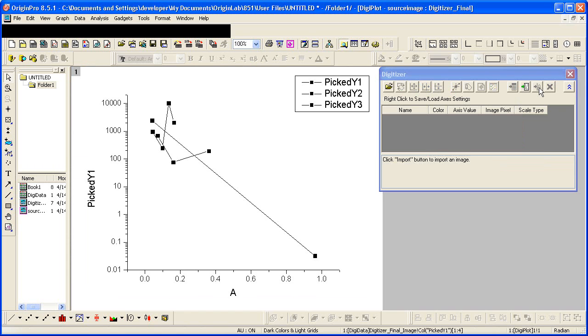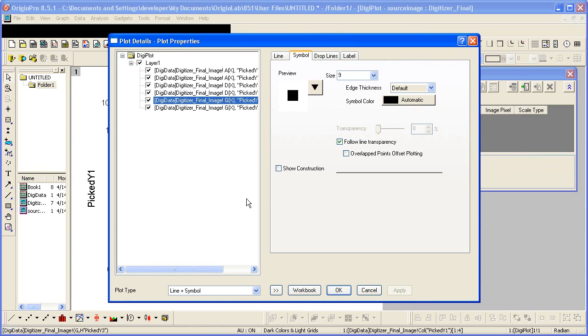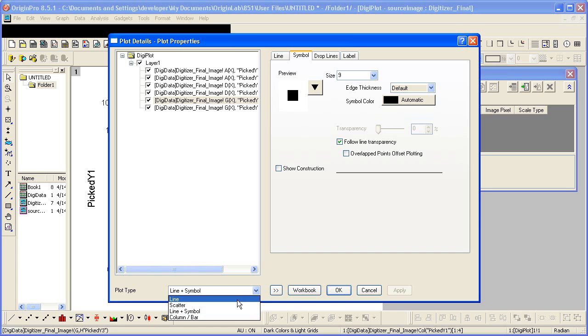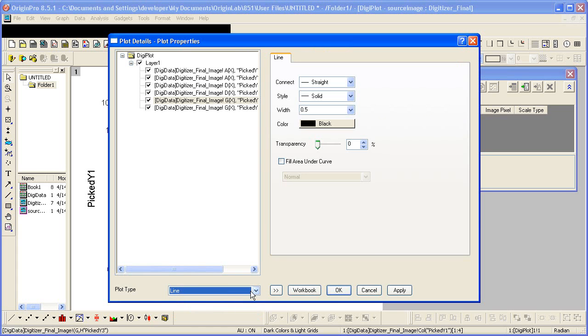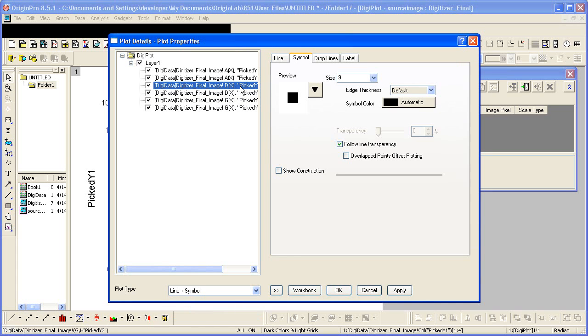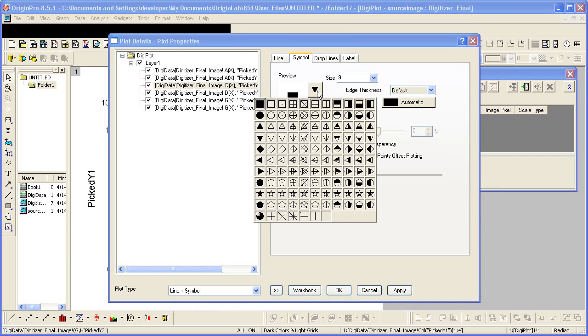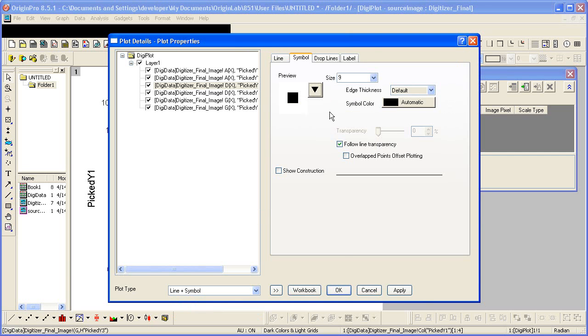If you wanted to change the plot type, you would double click. And like any graph, we can change the plot type as well as the different symbols. As needed.